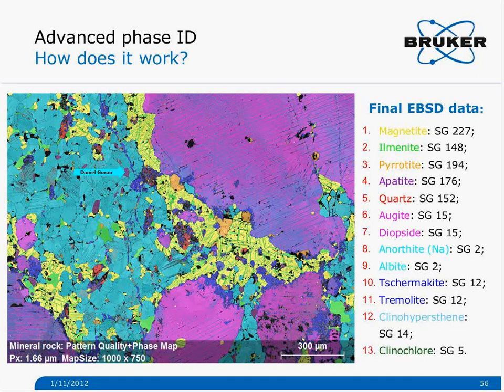You can also use the detected bands, because you always know if you see a solution found with 11 or 10 or 12 bands, it's a very accurate solution. You don't necessarily need the pattern as a confirmation in the background. If you see a solution found with 5 or 6 or 7 bands, then it might be questionable. So yes, the file size can depend on a lot. It depends a lot on what the user chooses to save.